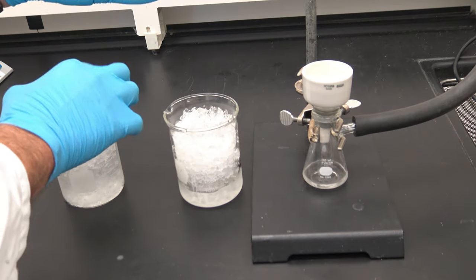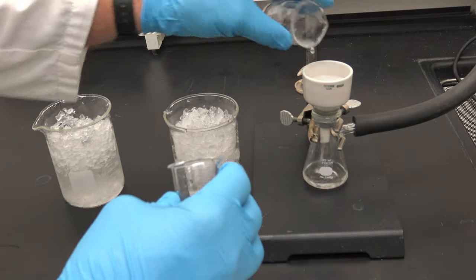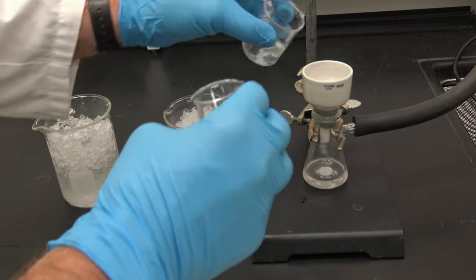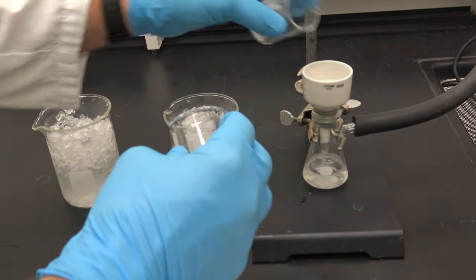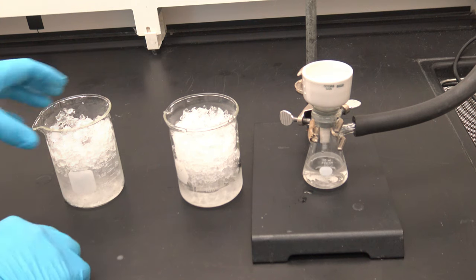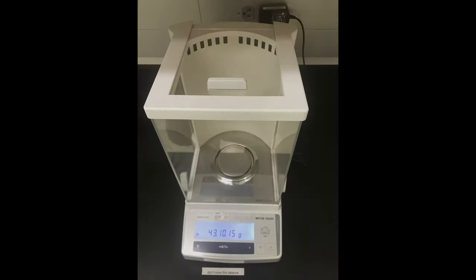And then I'm going to take some of my ice water and rinse out my beaker several times. And then we're going to let that sit for about 5 more minutes with the vacuum pulling on it. Scrape it off the filter paper. I'm pre-weighing my watch glass now.